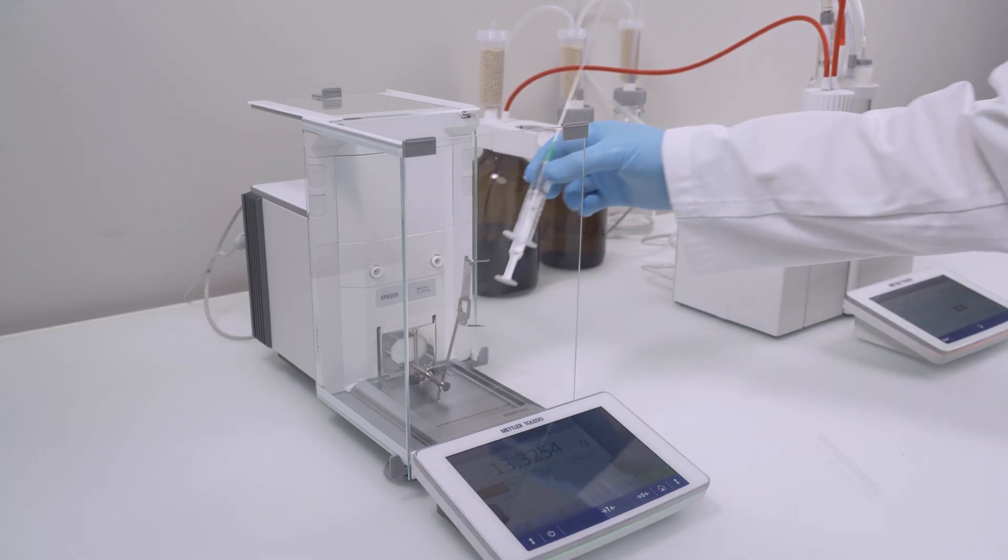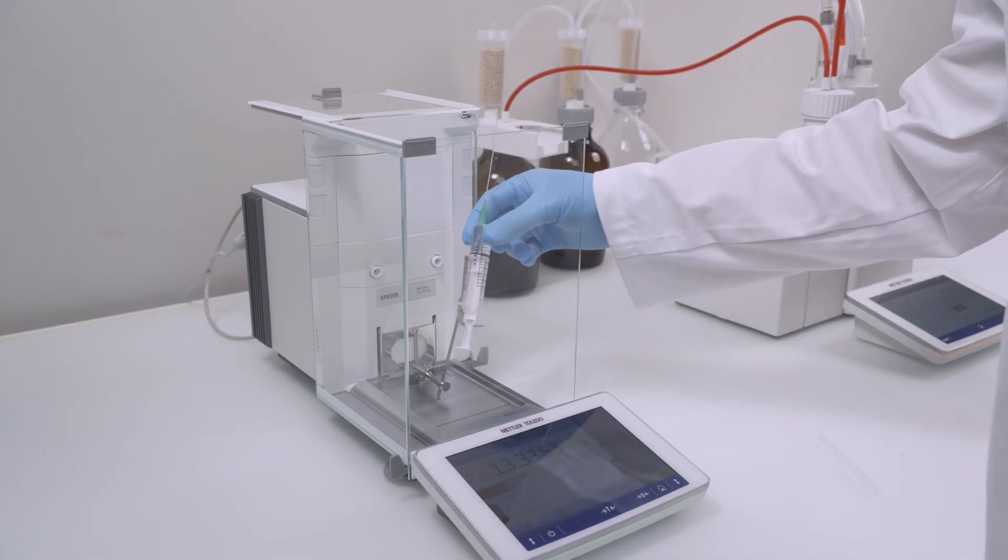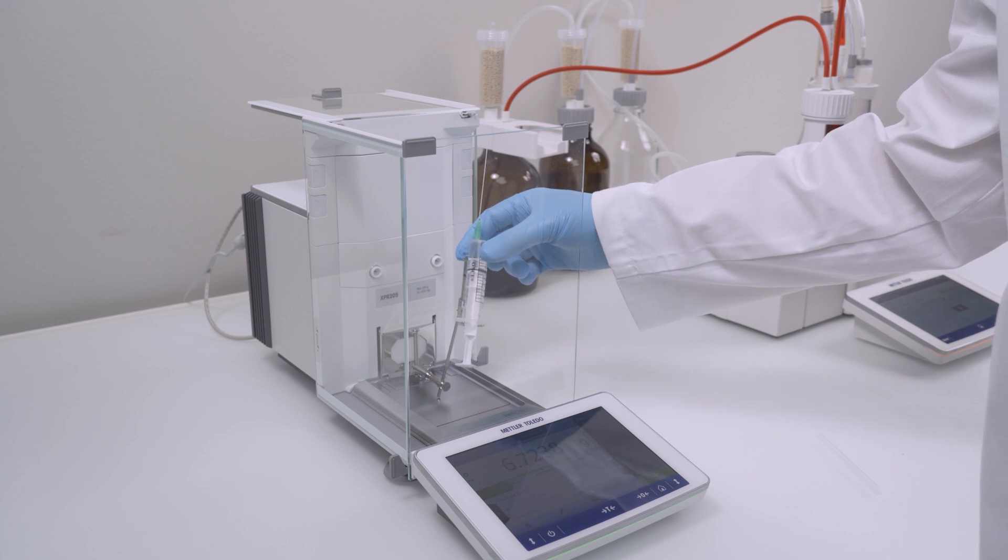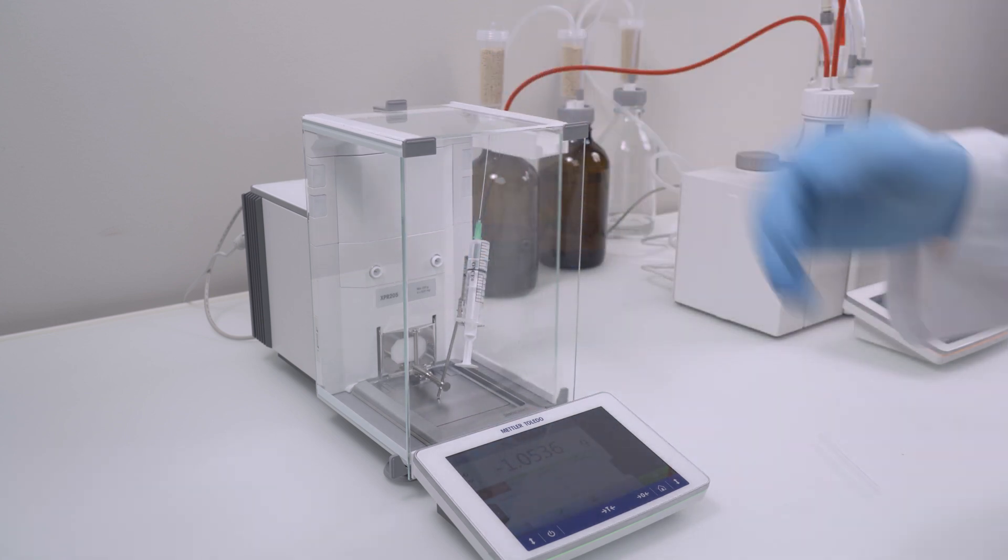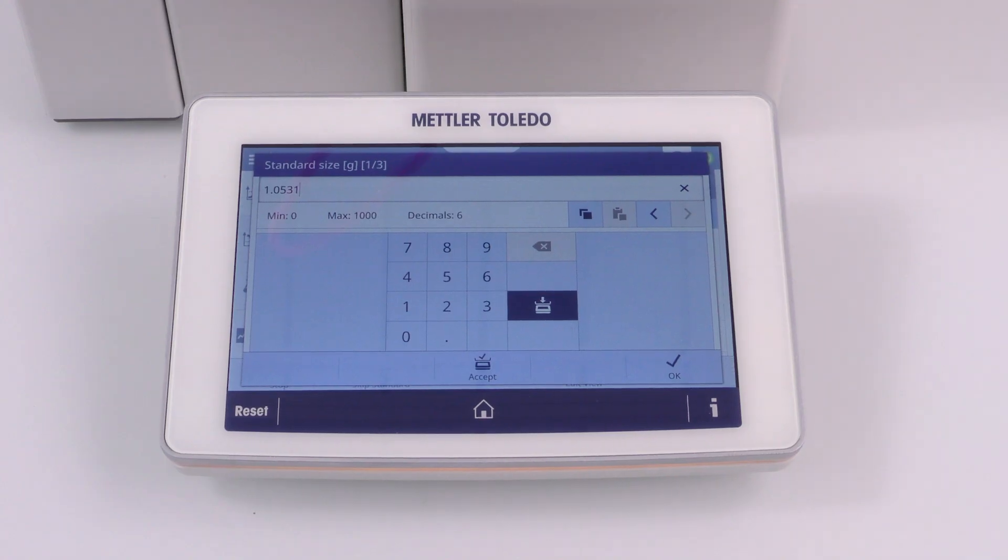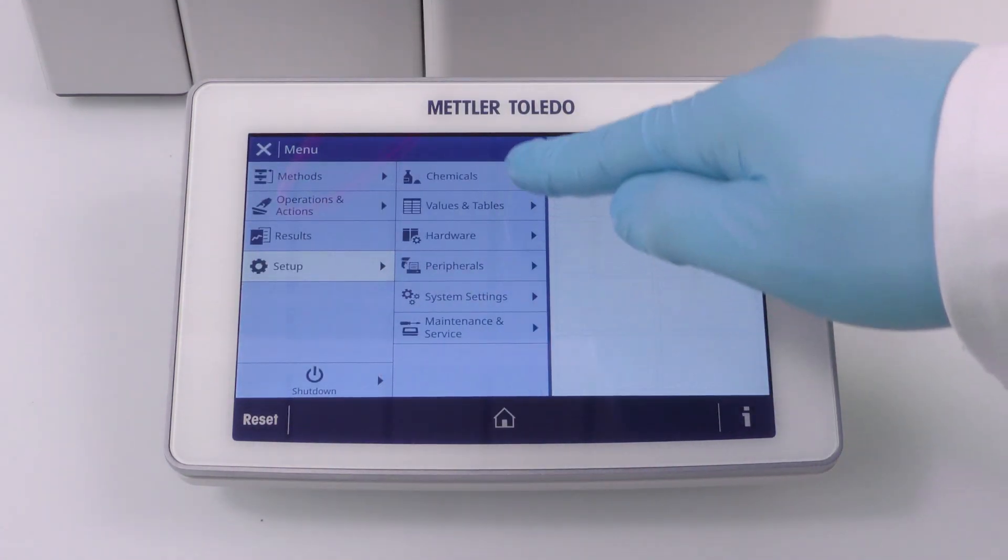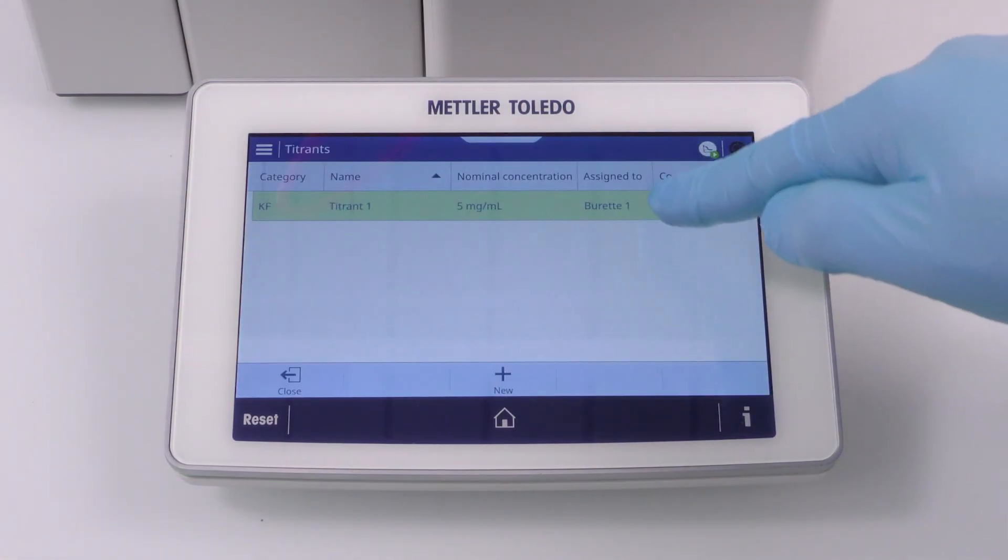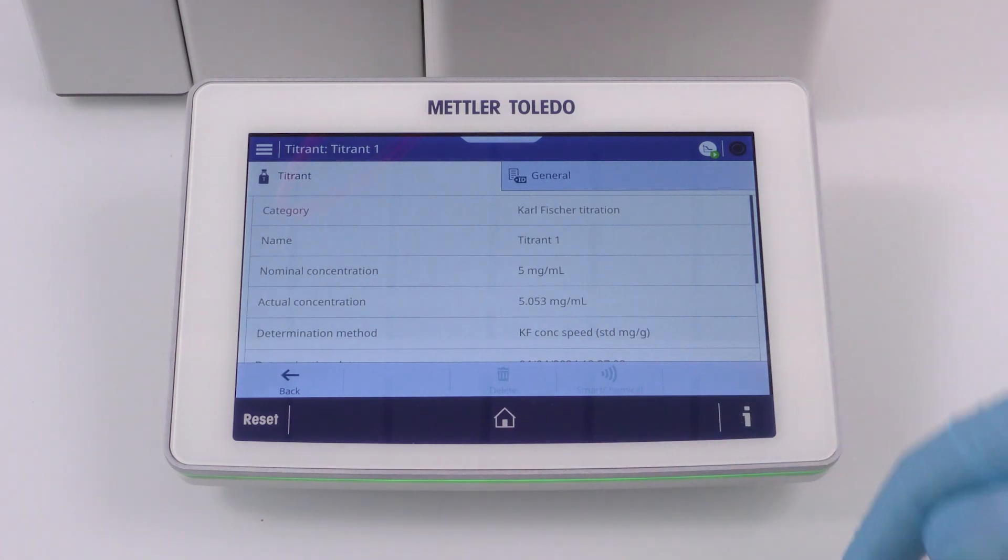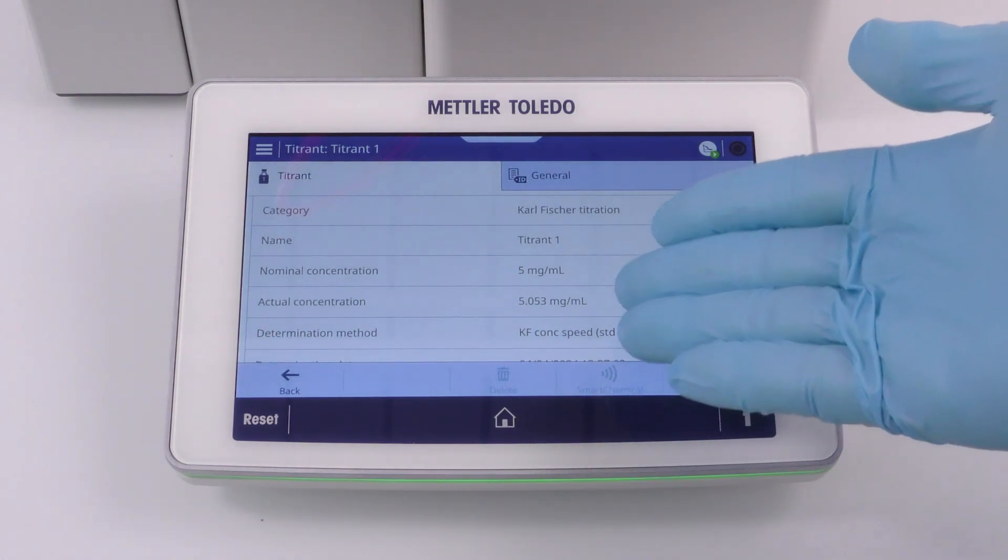After the injection of the standard, weigh back the syringe on the tared balance and enter the absolute weight on the titrator screen. On this system, the balance is connected via USB to the titrator for automatic weight transfer. So, the weight must only be confirmed, but not to be entered. Measure two more standards the same way. After all three standards are measured, the mean of the three measurements is saved as actual concentration of the titrant resource.